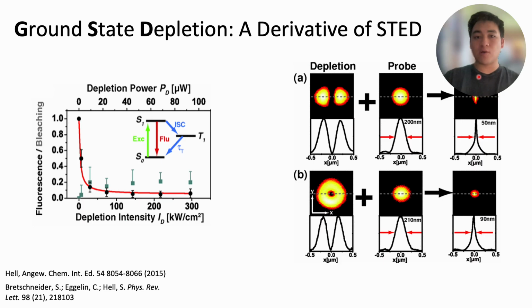And so future works in microscopy will continue looking at different previous pathways, such as D-STORM, to see how we can better refine what we see inside living cells with fluorescent microscopy.